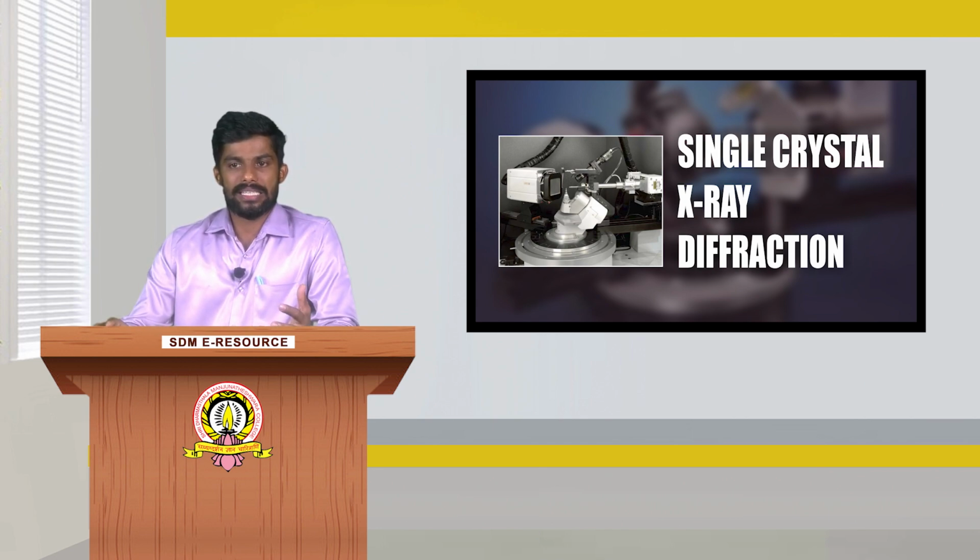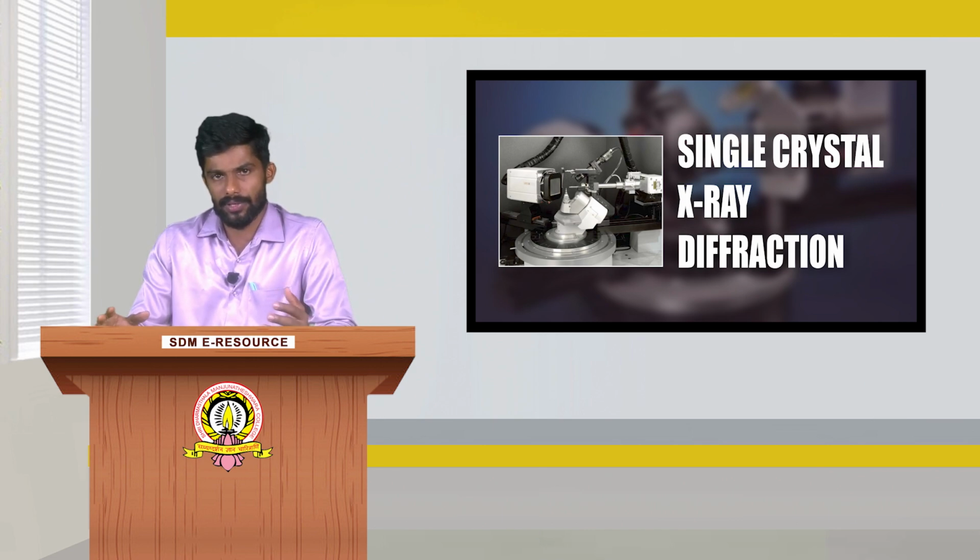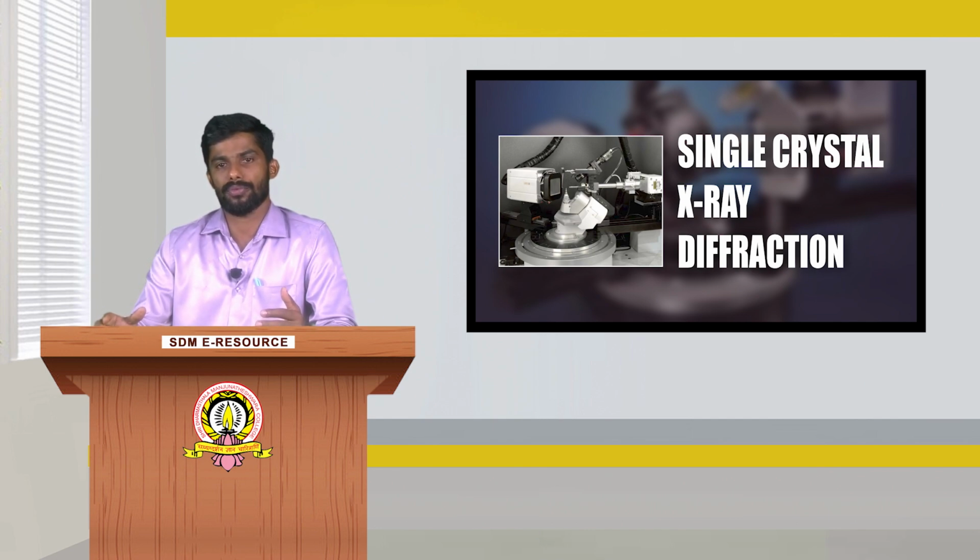And next is the X-ray detector system. As I already said, it makes use of counter devices. Especially, the single crystal X-ray diffractometer uses CCD, charge coupled detectors, microprocessor chips for detecting the reflections. The reflections are recorded by these CCDs. Earlier, computer assisted detectors were used. Now the advanced instruments make use of CCDs, that is, microprocessor based chips.